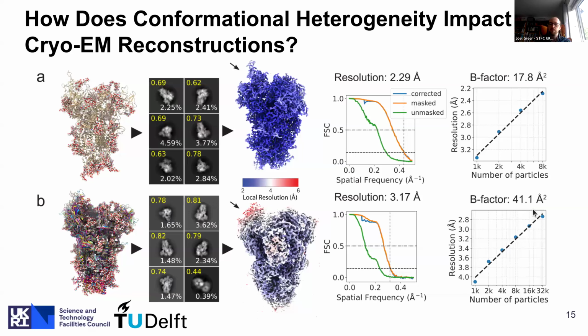This is still maybe much lower than we would expect from an experimental data set. And this may be due to a lack of a number of physical factors being present during simulation of the synthetic data. That might mean that the resulting alignments during reconstruction aren't perhaps as challenging as they might be for experimental data sets.